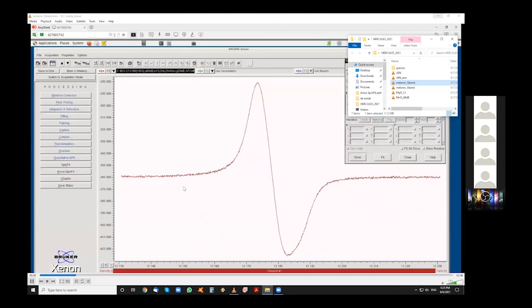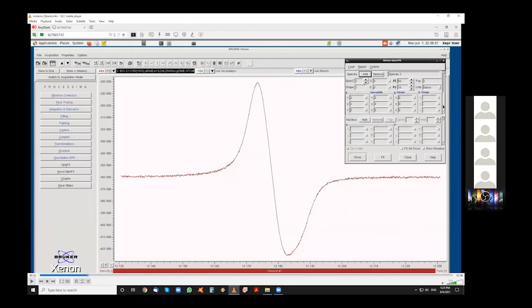And now if you look at the line, you will observe that it's not symmetrical anymore. We have a bump in the right part of the spectrum. So this is telling us that we don't have only one center here, we have another one. And we can observe this in the Q band because we have a better resolution of the magnetic field. It was what Mariana presented earlier.